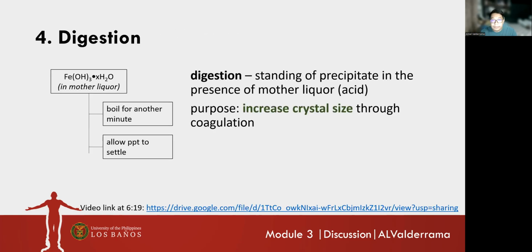So part of your pre-lab questions is what happens if you prolong the digestion. As mentioned in your procedure, digestion must be done for exactly 1 minute. Okay? So prolonged digestion means the digestion was done for more than a minute. By prolonged digestion, it just means that the increased crystal size will revert back to its colloidal form.